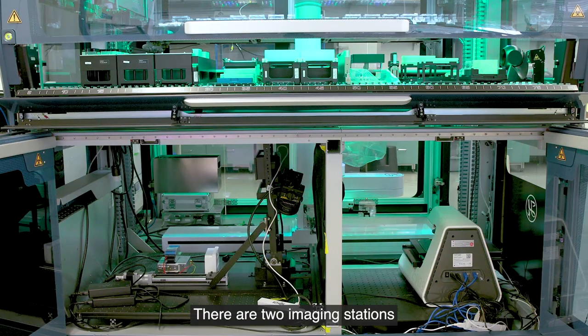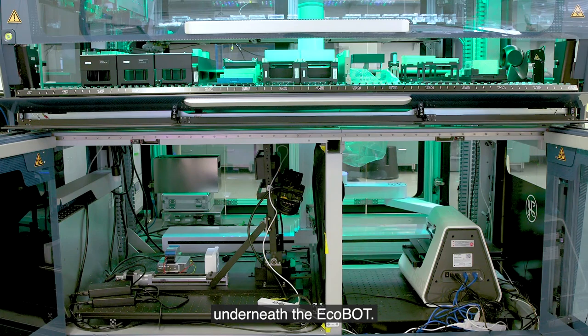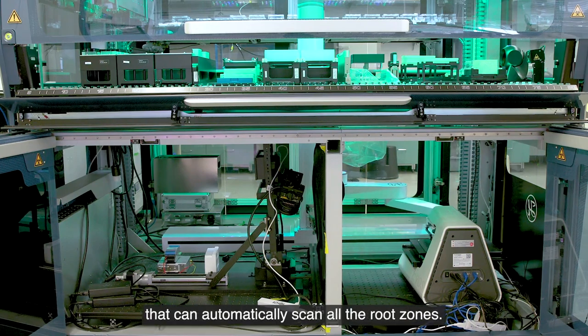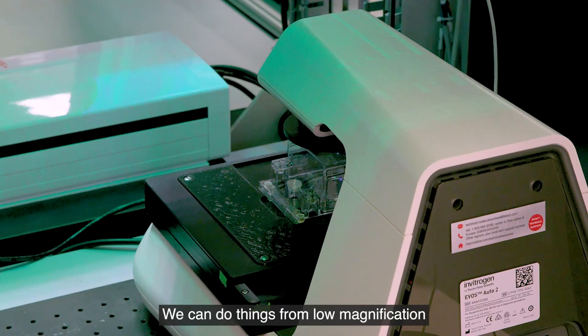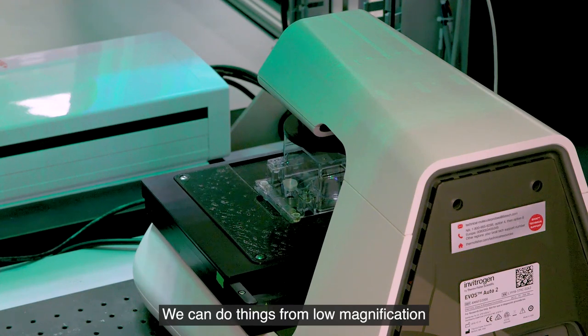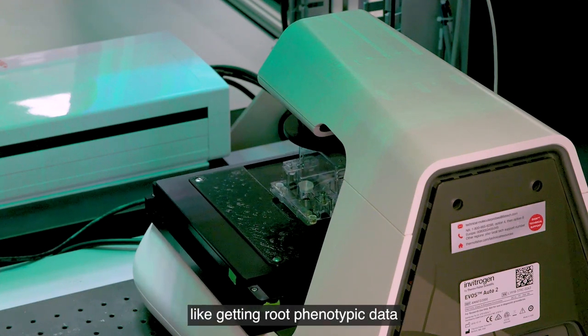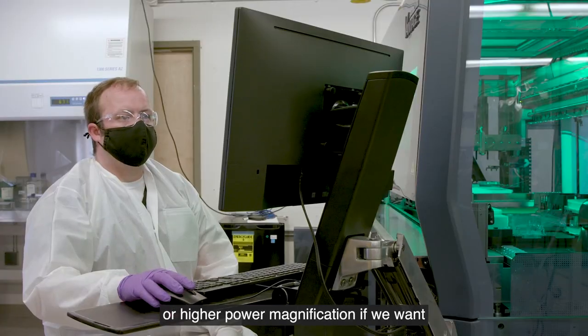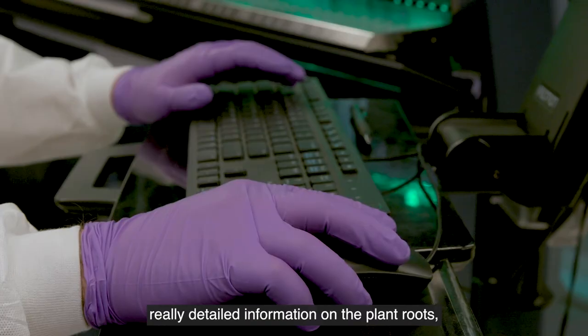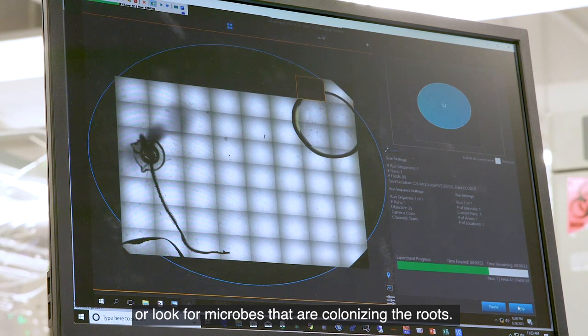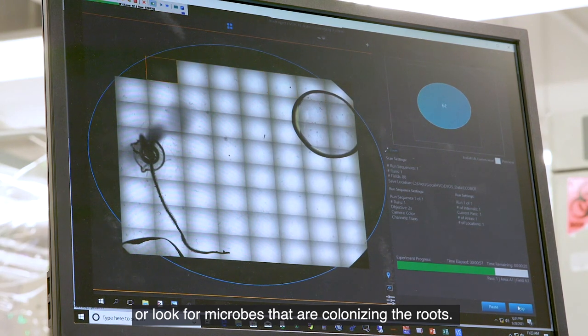There are two imaging stations underneath the ECOBOT. One is an inverted microscope that can automatically scan all the root zones. We can do things from low magnification like getting root phenotypic data or higher power magnification if we want really detailed information on the plant roots or look for microbes that are colonizing the roots.